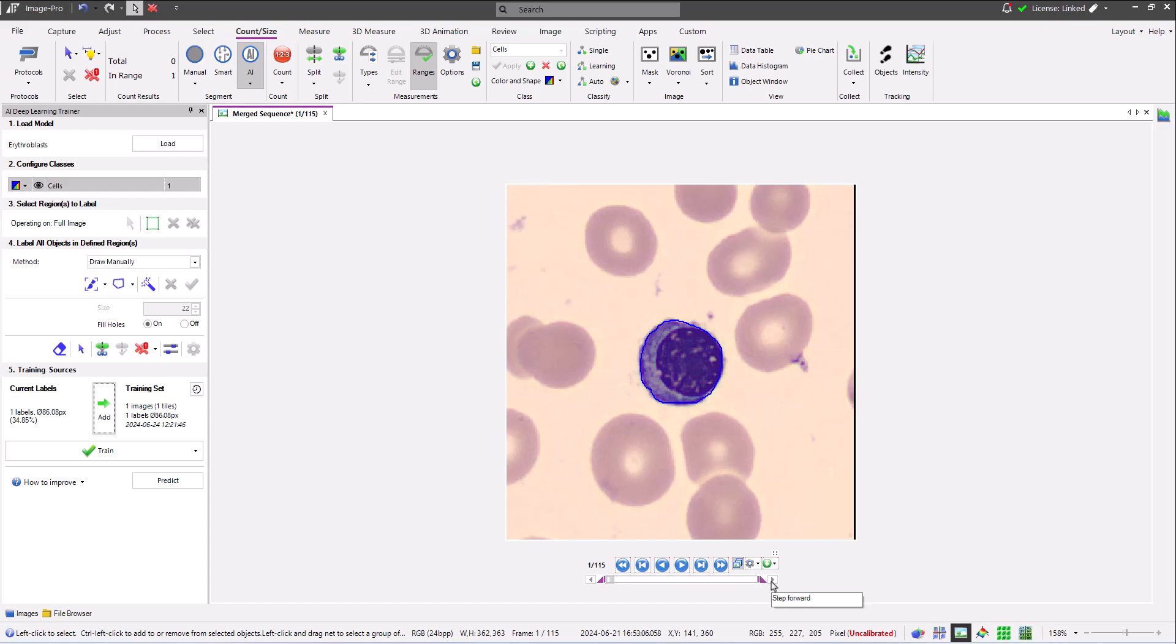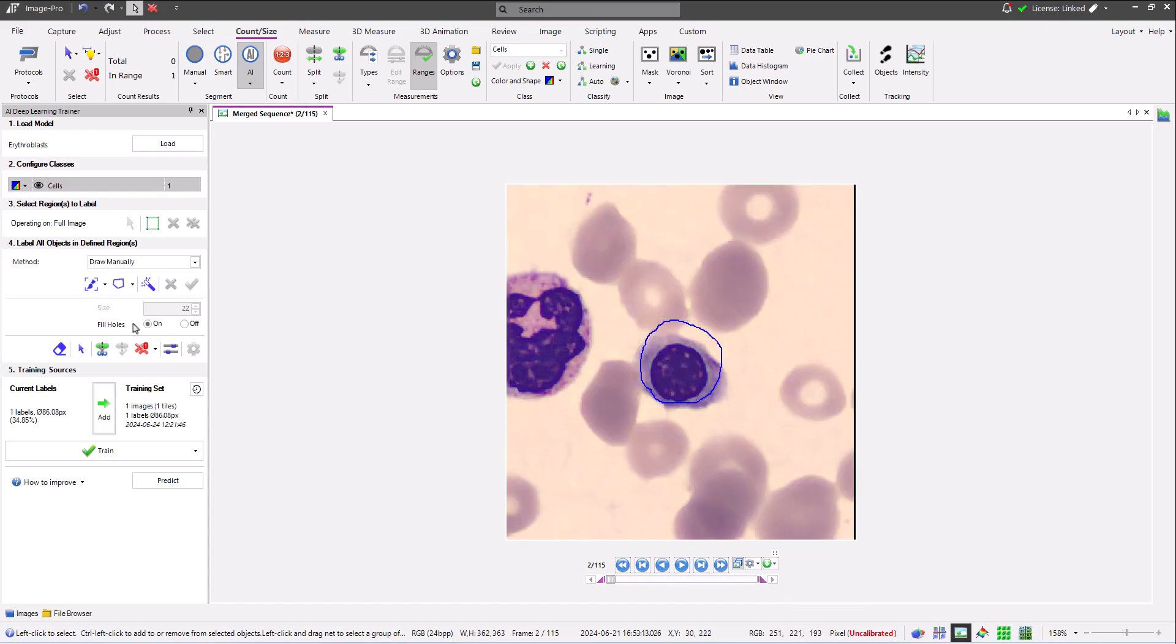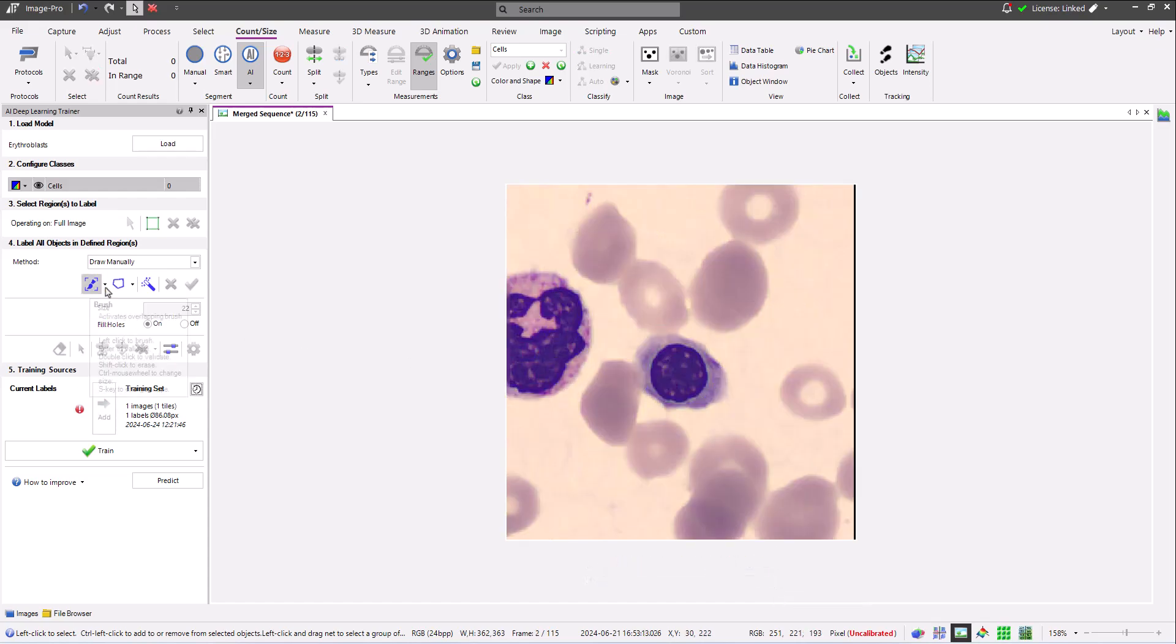I can now change the frame of my training sequence and add a couple more training labels.